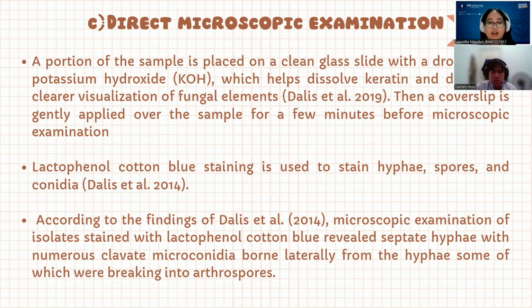Then, lactophenol cotton blue staining is used to stain the hyphae, spores, and also the conidia. According to the findings of Dalis et al. 2014, microscopic examination of the isolate stained with lactophenol cotton blue revealed septate hyphae with numerous clavate microconidia borne laterally from the hyphae, some of which were breaking into arthrospores.